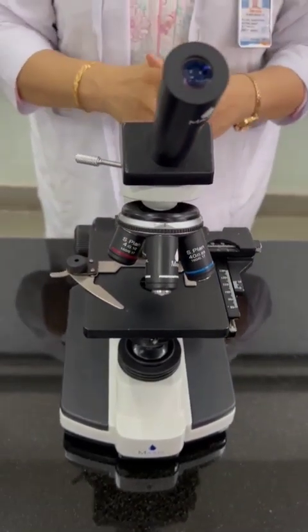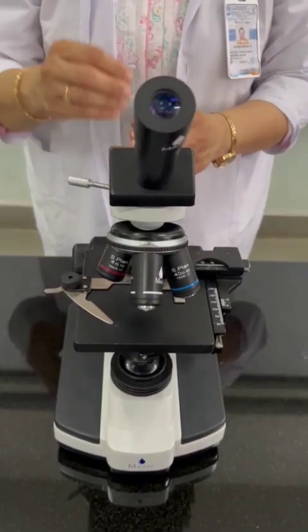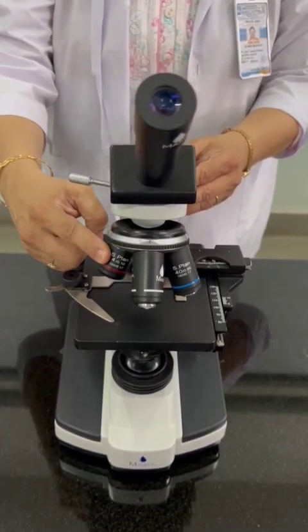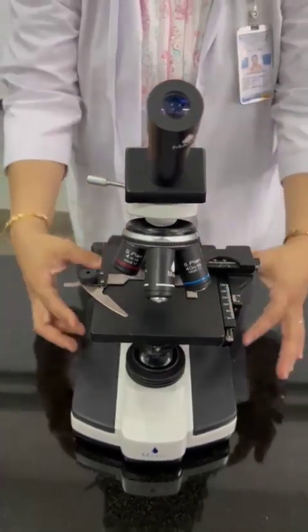The objective is responsible for forming a primary image of the specimen. It is also responsible for controlling the quality of the image that is formed. It forms a real image of the object. Coming to the next, that is substage parts.